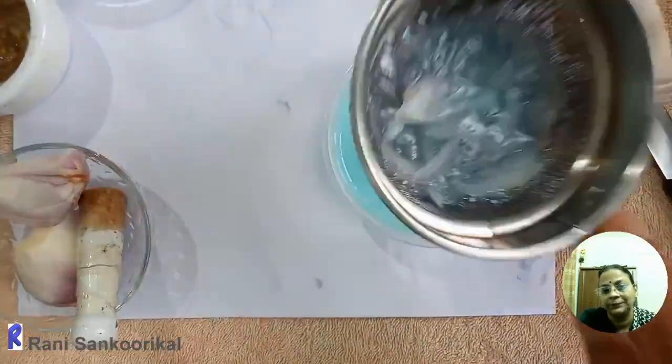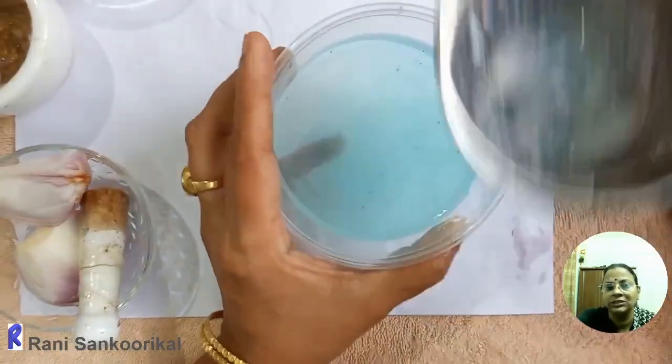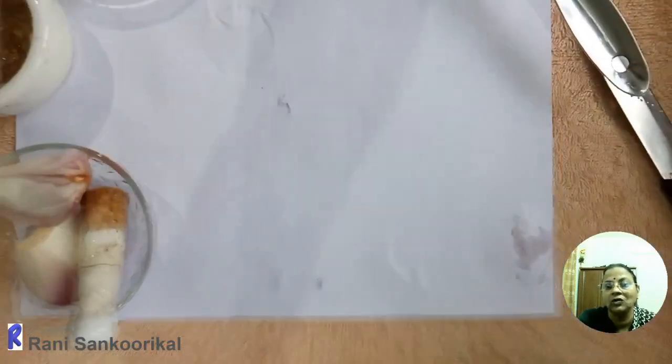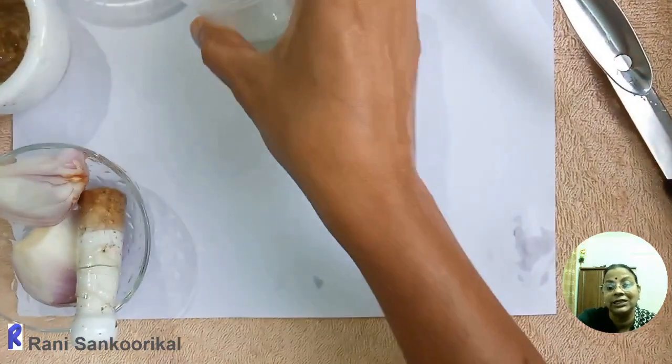Then again you keep it aside for a few more minutes to make sure that the frothy appearance goes away and the precipitation of the DNA takes place in proper time. So after 10 minutes, you will get a clear solution of the onion extract.